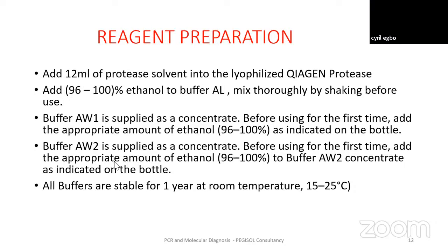The same thing with buffer AW2, you equally need to add absolute ethanol to the concentrate. After preparing all these reagents, they are very stable for 1 year at room temperature. So you can use it for 1 year, that is if you don't have a high volume of work.